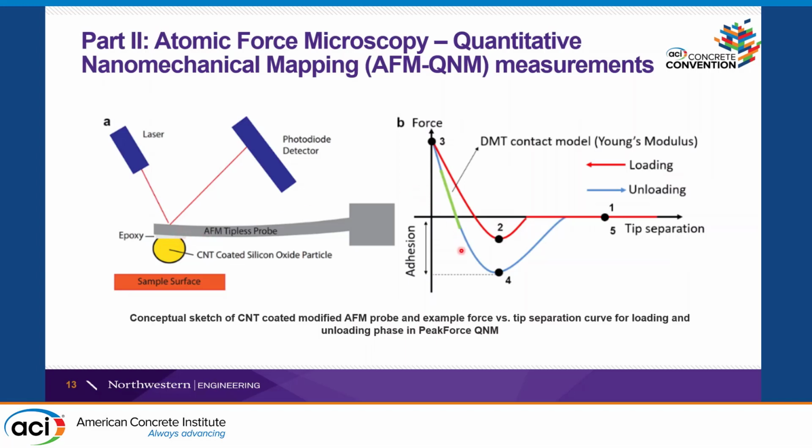And then we perform a peak force test where we apply a force displacement of the tip until we touch the substrate, and then we pull it away, like pulling a tape off the surface. And we can measure here the adhesion force between the CNT and the substrate.